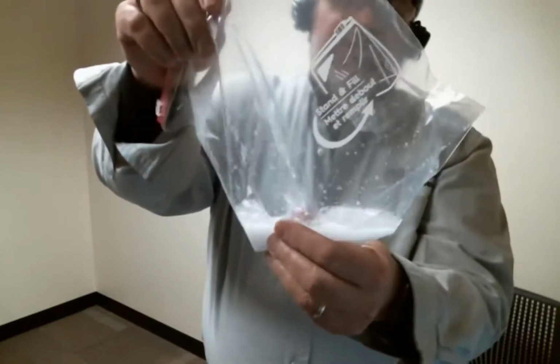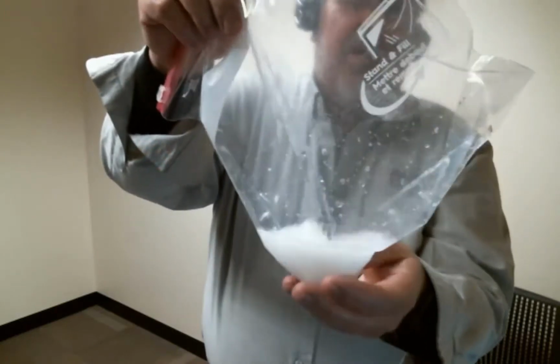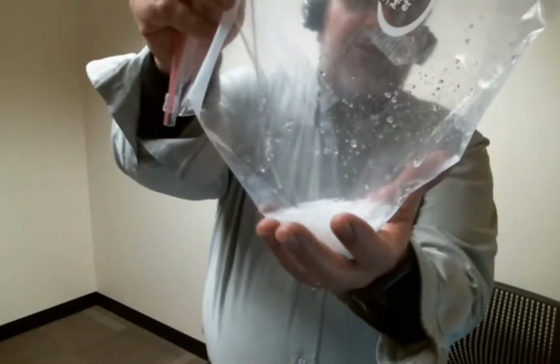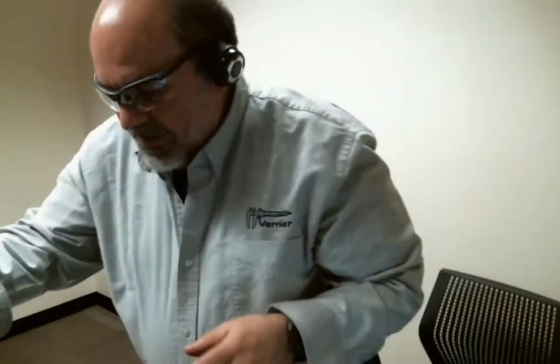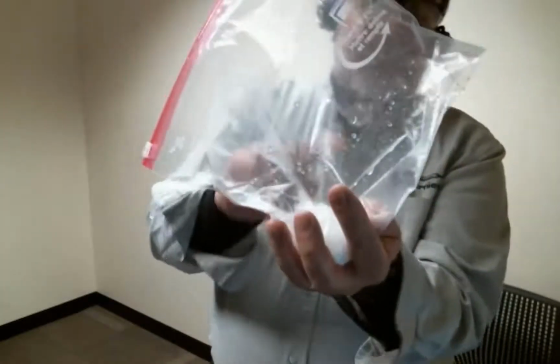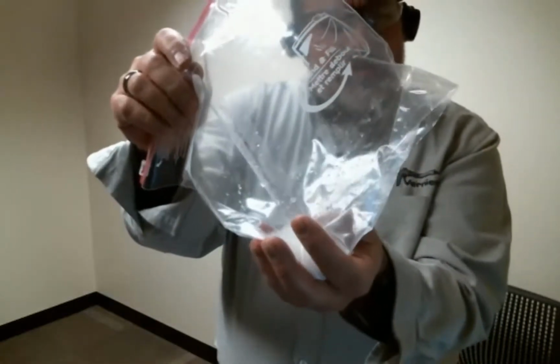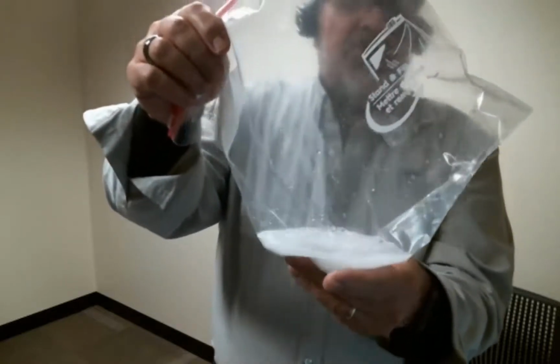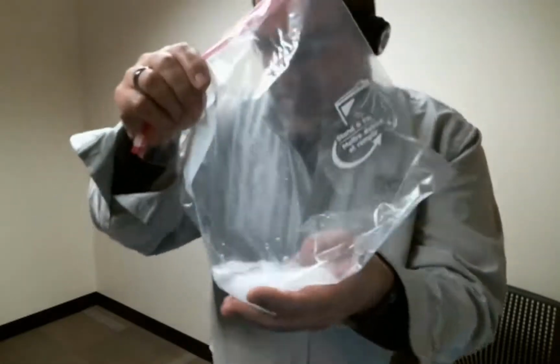Most of them will predict that this got hot because it bubbled and fizzed and made all this gas, and so they will predict that the baking soda and vinegar gets hot. So let's keep that in mind, and what we're going to do is switch over to measure this change in temperature and also make some predictions. And then further, we're going to extend the experiment to another situation. So that's the plan.